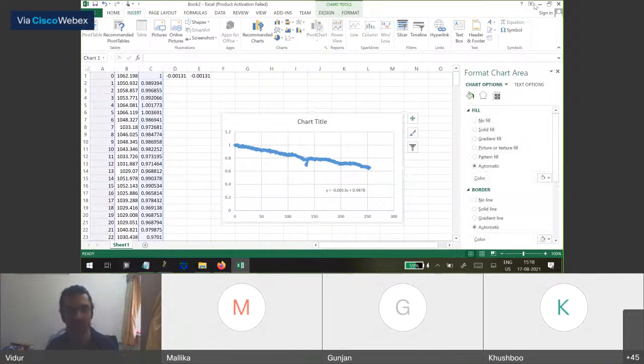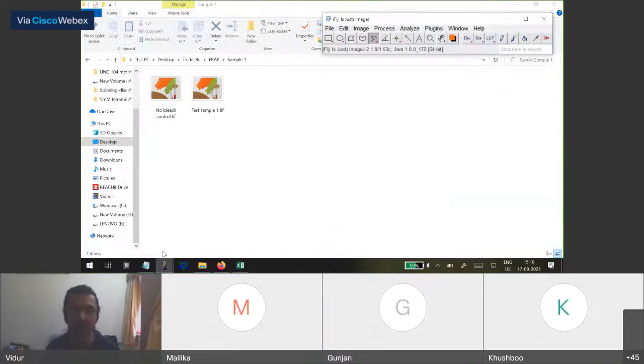I hope everyone has followed till now. Our test sample now. This is all that needed to be done from the no bleach section.